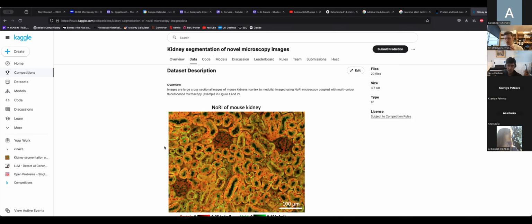So you could imagine that old kidney just contains much more lipid than young kidney overall as a tissue, right? We would notice that. We do not need any image parsing for that. You could imagine that the overall level of lipid is about the same, but lipid has moved from glomeruli in young kidney out of glomeruli in old kidney. In order to detect that, we need to know which pixels actually belong to glomeruli. You can imagine that lipid has moved into nuclei in cells, and maybe not in all cells, but only in cells constituting a tubule. Right?